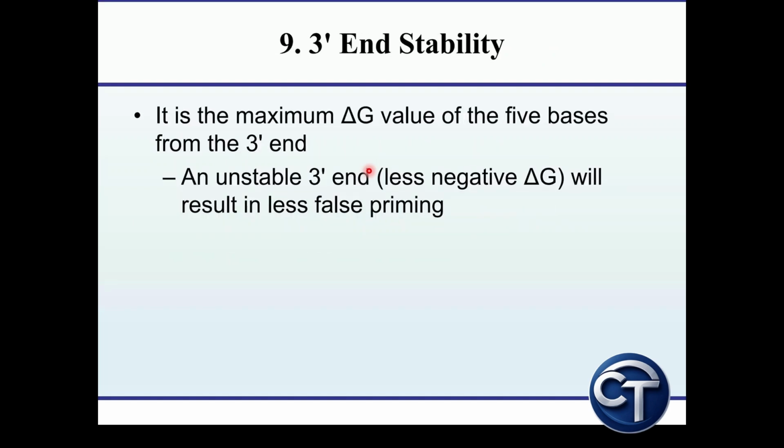Now let's move into a slightly advanced concept, that is thermodynamics. Primer binding is governed by Gibbs free energy, denoted by delta G. Negative delta G indicates stable binding. Extremely negative delta G suggests strong secondary structures. And what do we aim for? Moderate delta G values, stable primer-template binding without unwanted interactions. Thermodynamic balance ensures efficient and specific amplification.